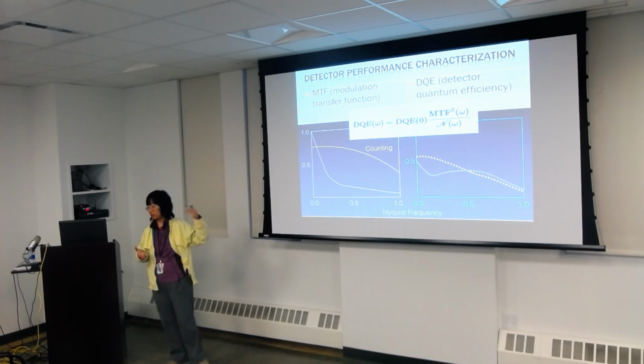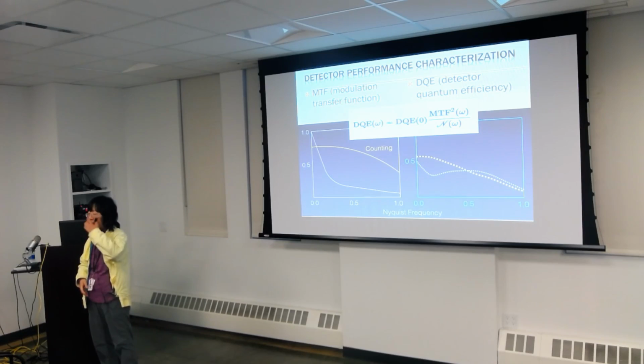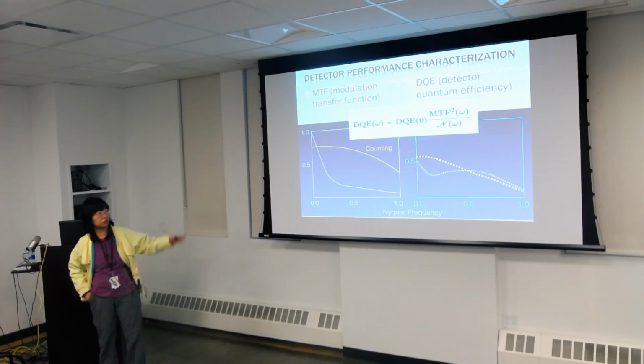Right. Can I ask something? Mm-hmm. I don't have a good understanding yet, but if the envelope function is essentially a mask function that your detector imposes, shouldn't that be a denominator as opposed to a numerator, since it's going to dampen your signal and not multiply it? But remember, it's going to dampen everything. Anything that you see in there. Oh, including the noise. Yeah. So it dampens everybody. Okay. That's why they do it this way.